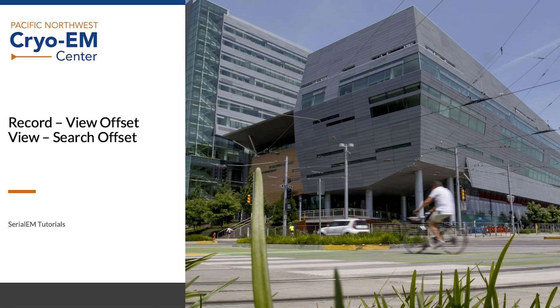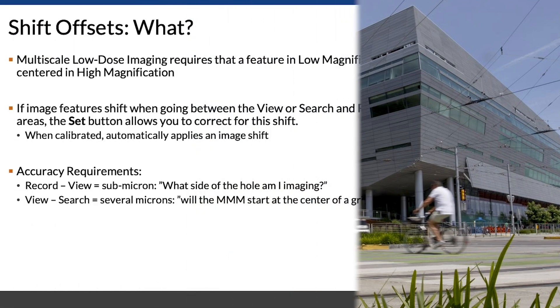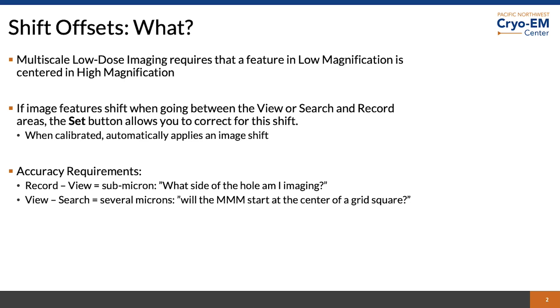Record view offset and the view search offset. What are the shift offsets?